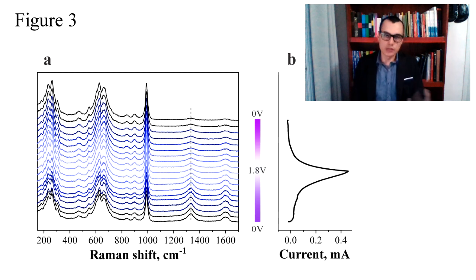Looking at region 1, we can see only a change in the intensity of the 990 cm⁻¹ band. It's a band corresponding to the sulfate. We understand this indicates that with an increase of applied potential, more sulfate ions are attracted to the carbon-based material decorated with niobium electrode surface. This explains the increase in counts in the Raman spectra.